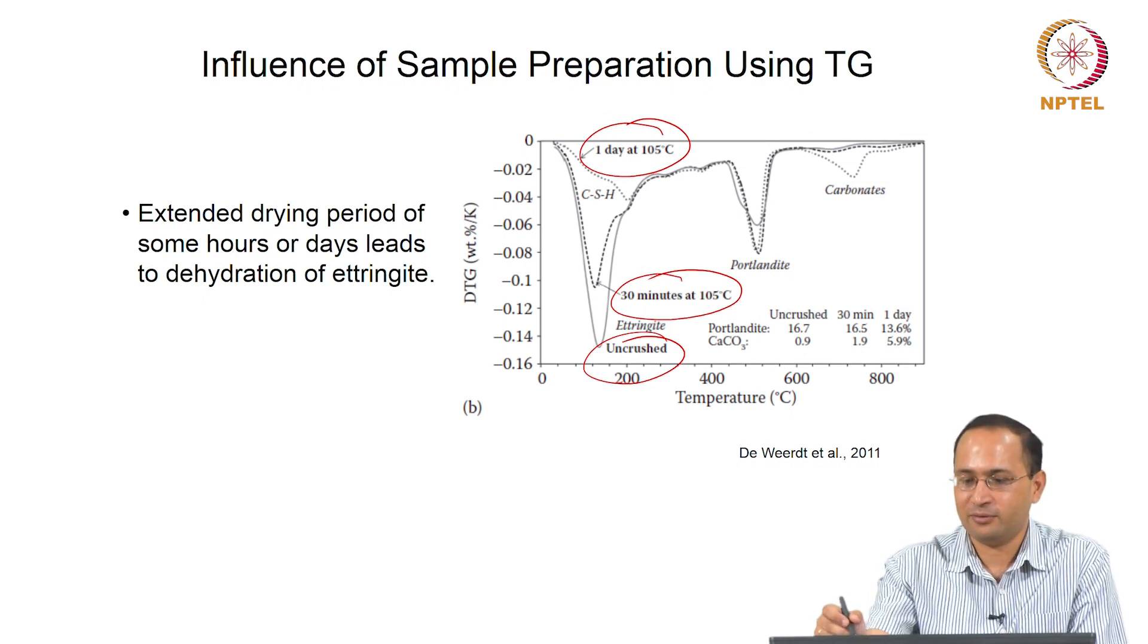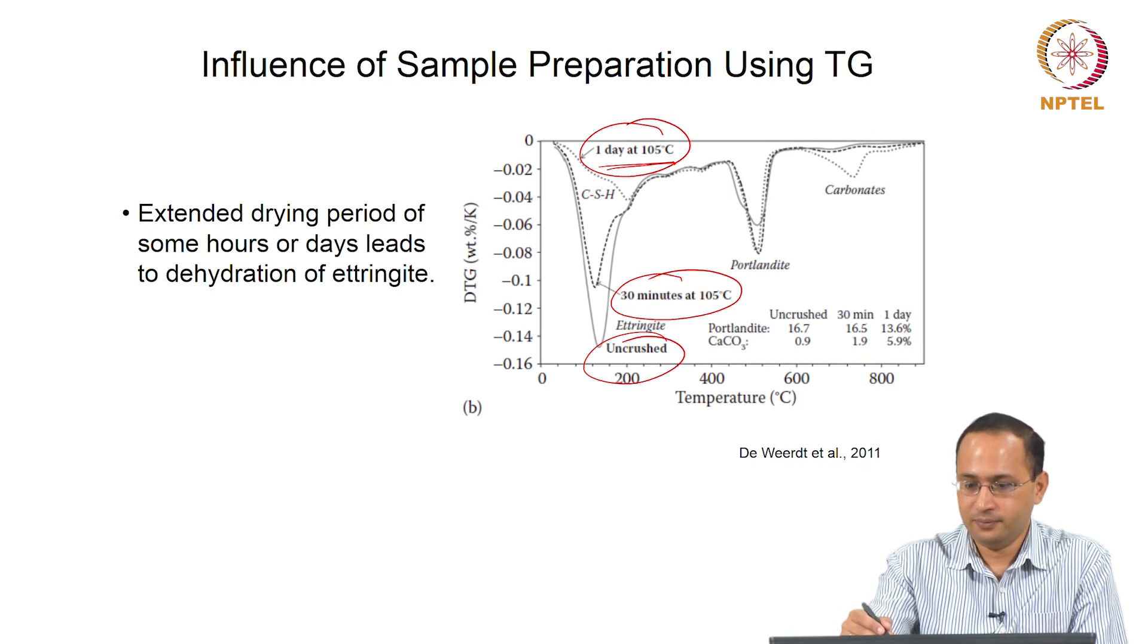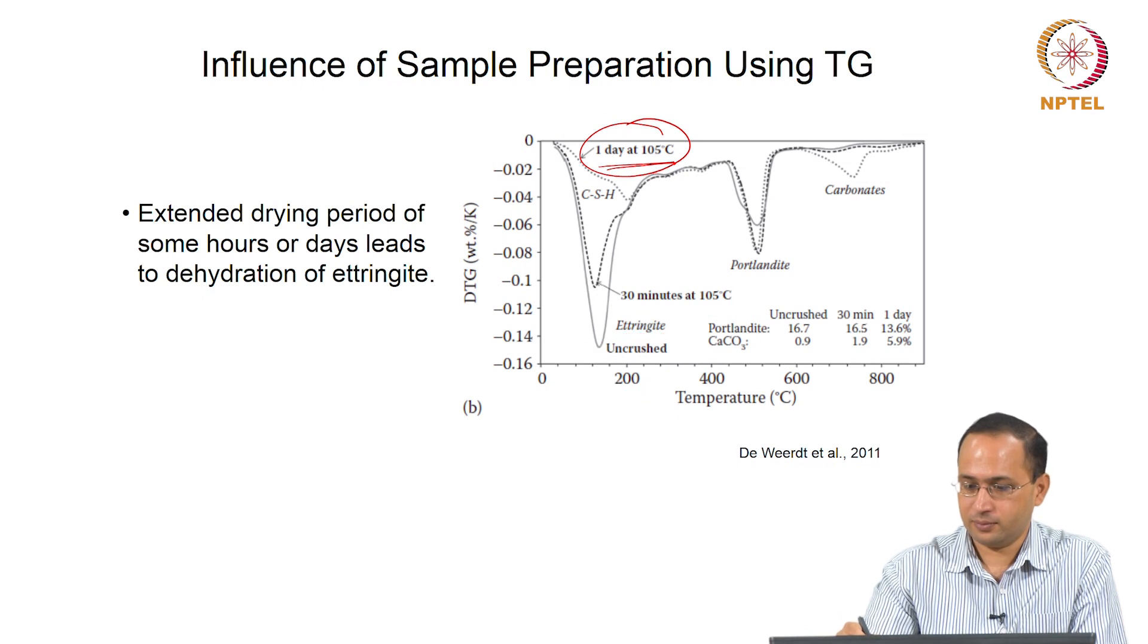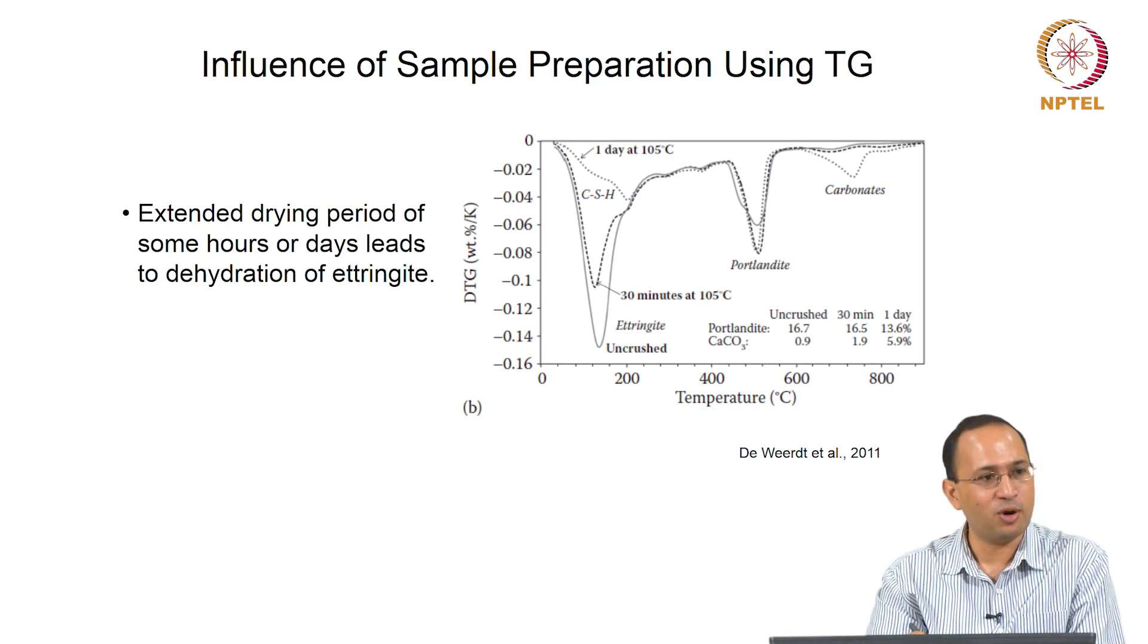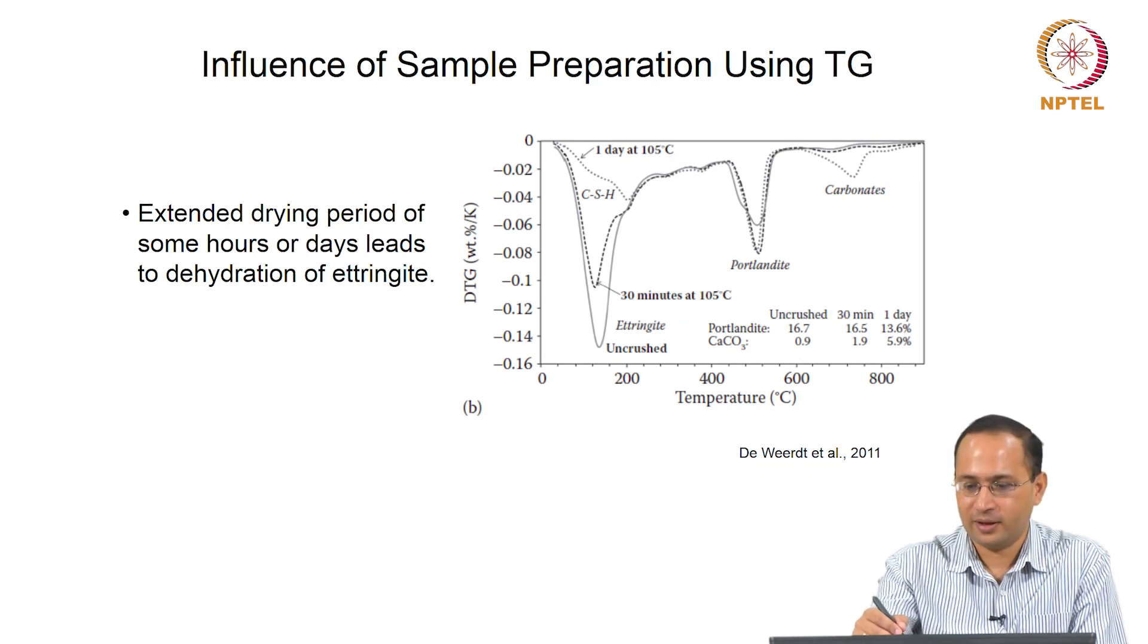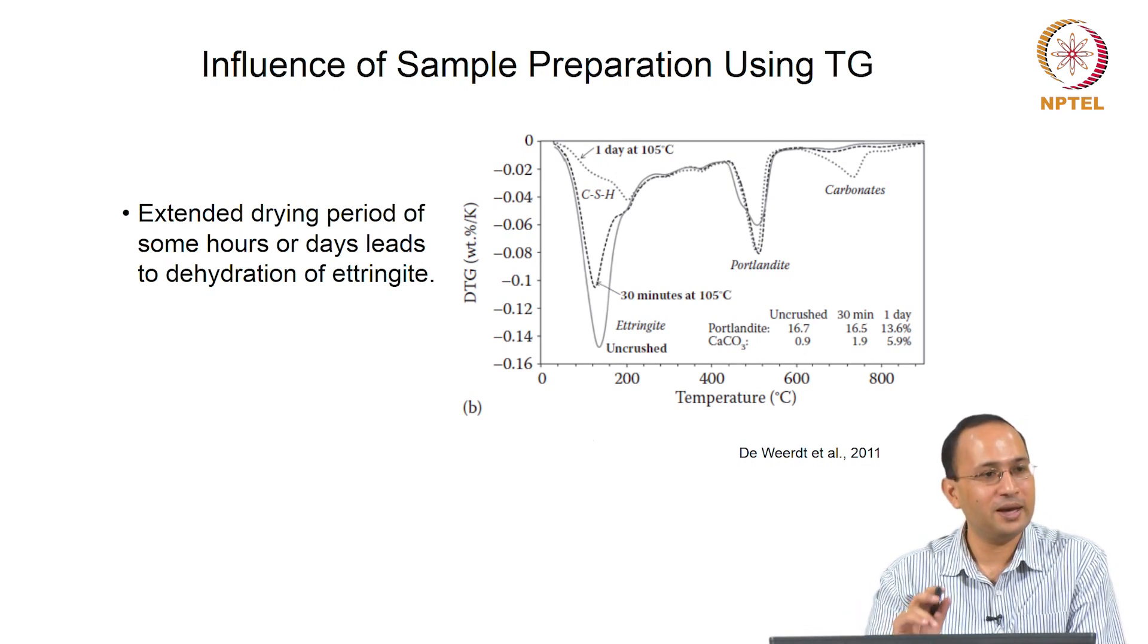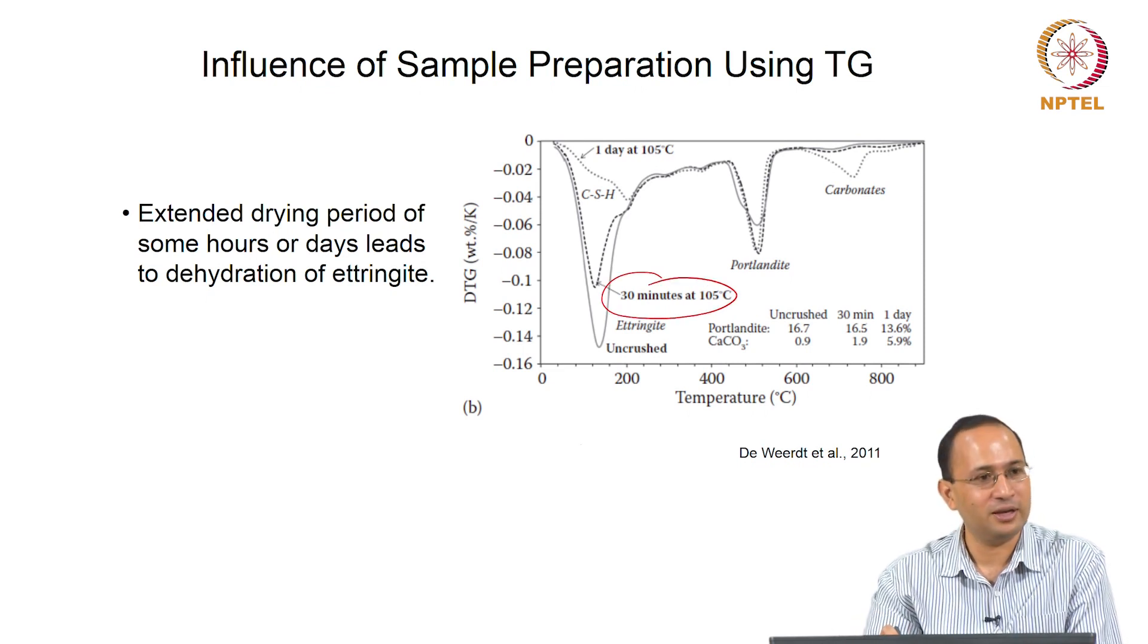Here you have an example of sample preparation. When you heat your sample for one day at 105 degrees Celsius, it drastically reduces this peak compared to undried samples. This tells you that your drying process is affecting the amount of CSH and ettringite. Even 30 minutes of drying at 105 degrees Celsius will affect your initial peak.